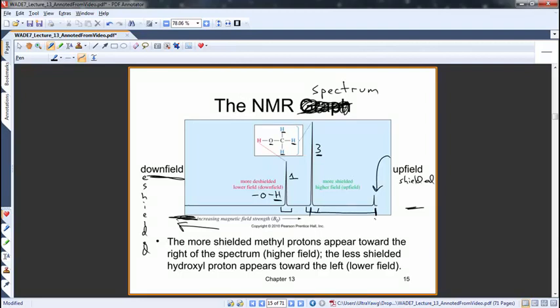That's some value. What is the distance from here to here? That is some value. Now I can compare this to someone from another experiment because I'm making the same comparison. It's a difference from an internal standard that everyone uses. So this is our TMS internal standard. And so when you run NMRs, you'll run it with TMS. If you look at an NMR spectrum, sometimes this shows up. Sometimes people leave it out because it's assumed to be there.